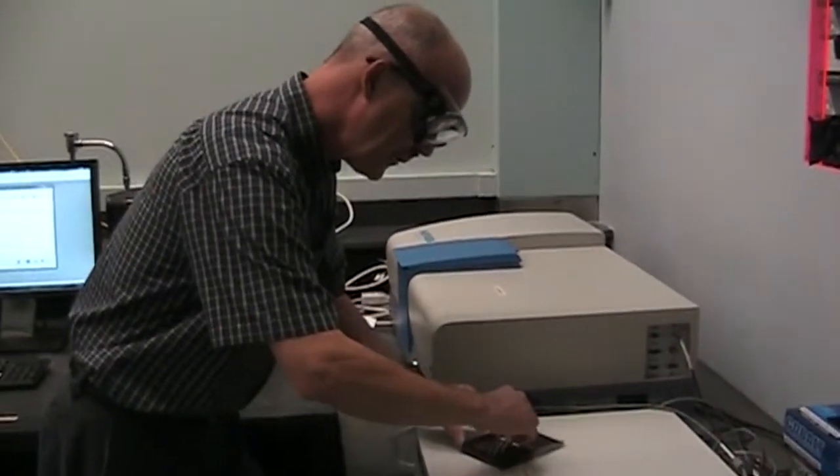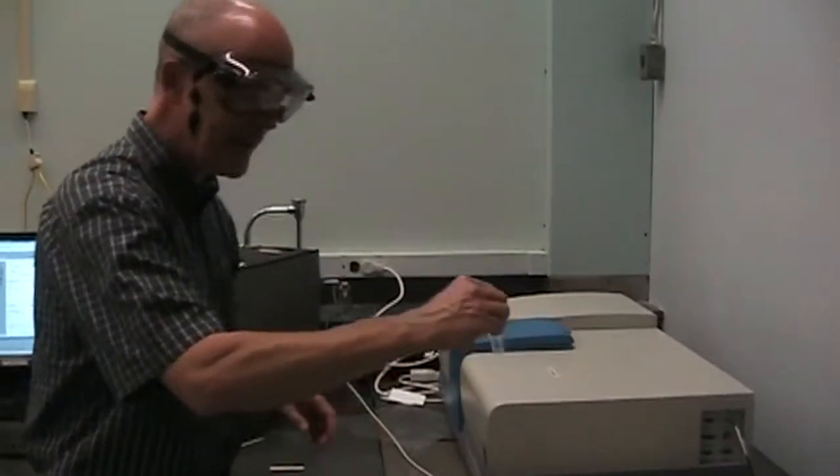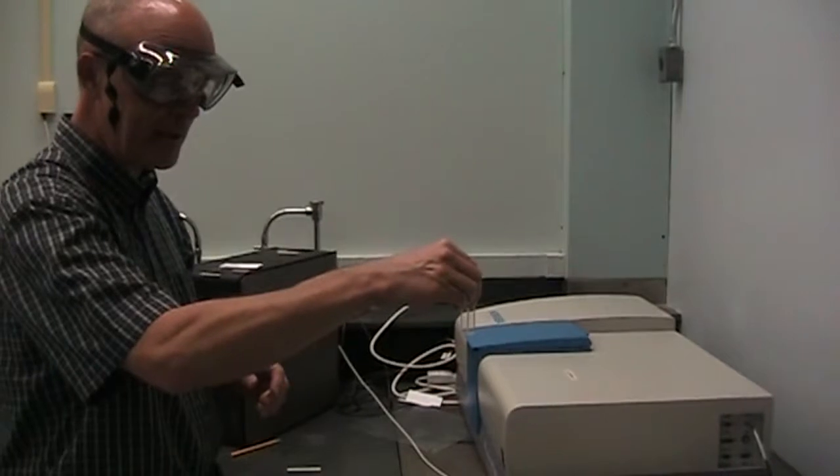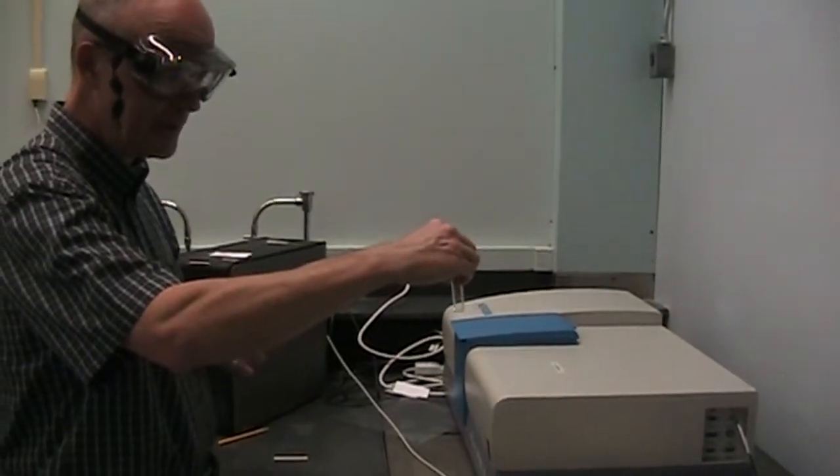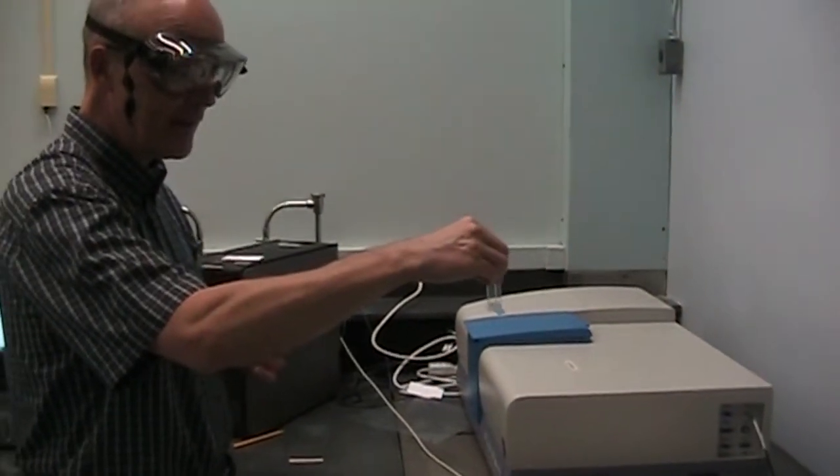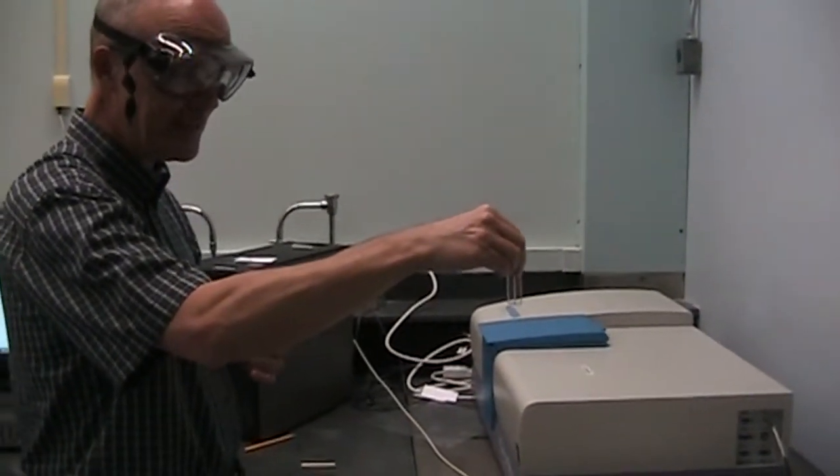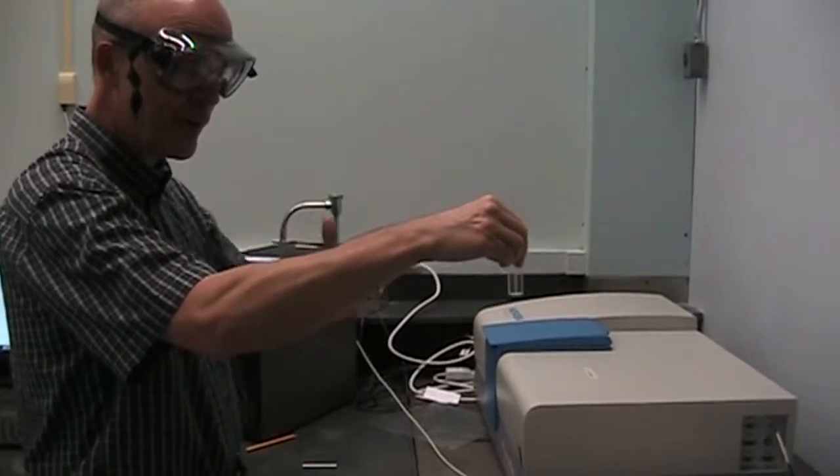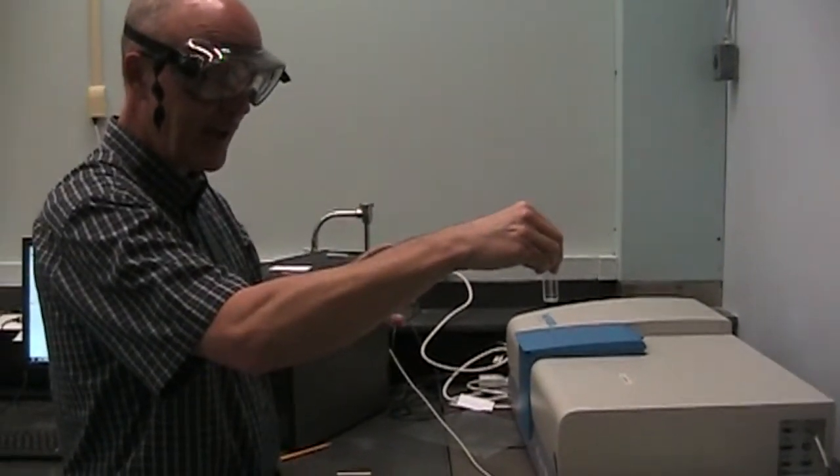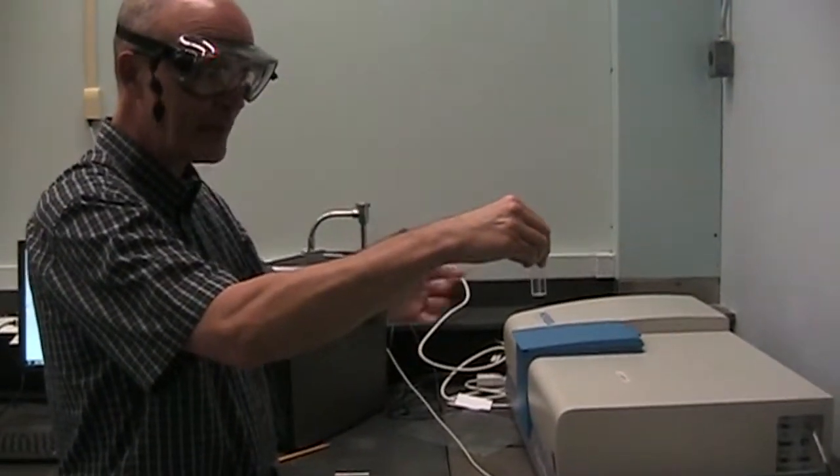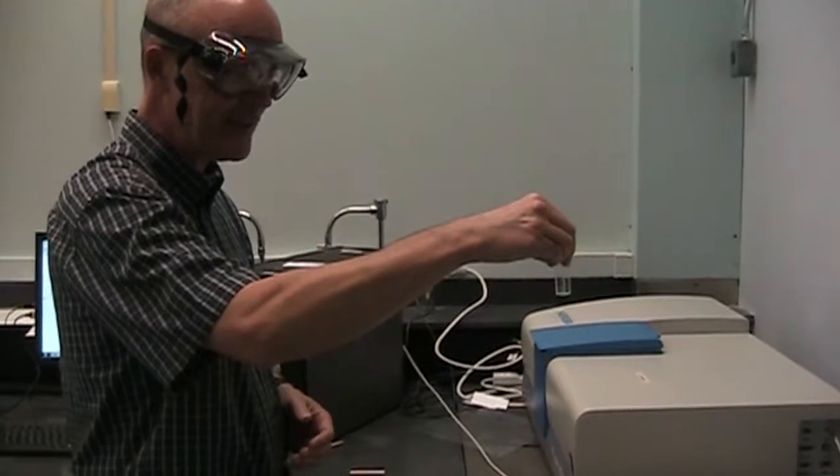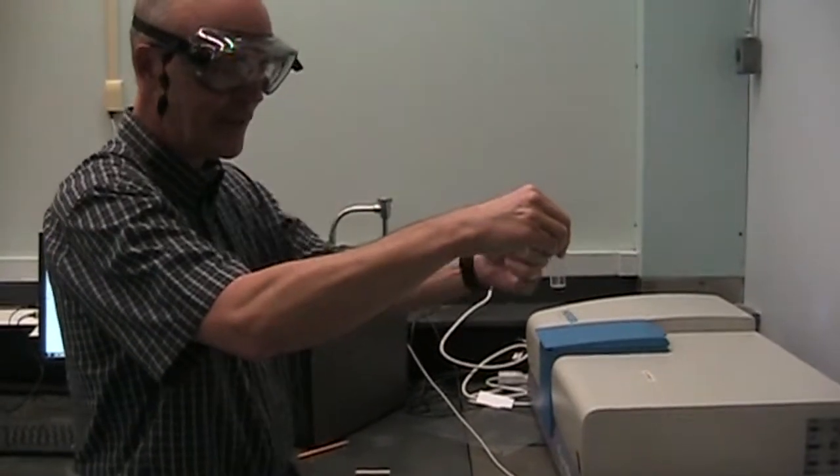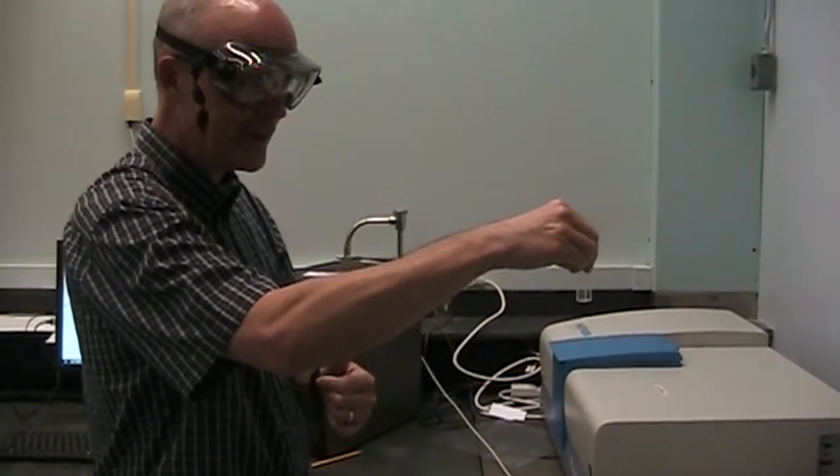So the sample gets contained in a cuvette much like we would use in an ultraviolet-visible absorbance instrument. The difference here that you may be able to see is it has four clear sides. Four optically clear polished sides. Light can go through very efficiently in any direction.